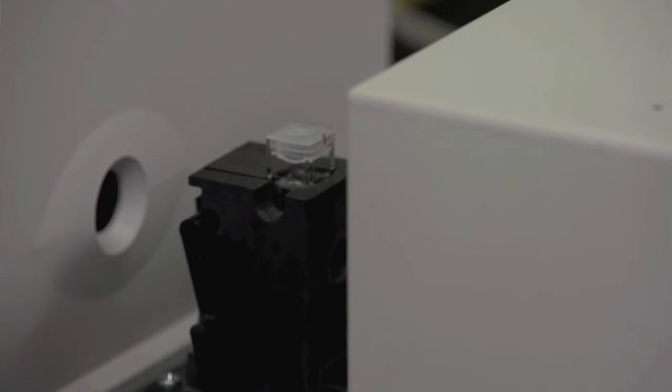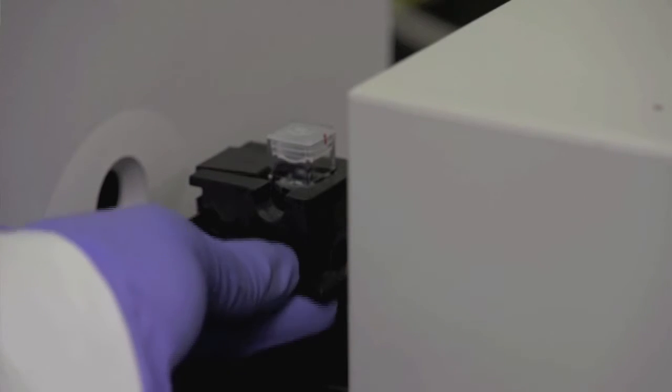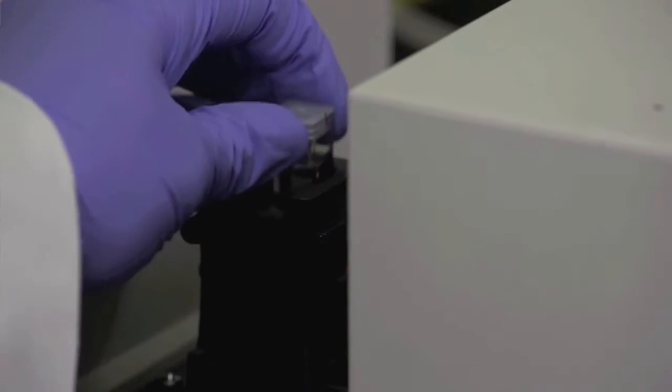Now that we've collected the background, we are ready to collect a sample of the cyanine dyes. To remove the cuvette, lift the arm up to unlock the cuvette from the sample compartment and remove the cuvette.